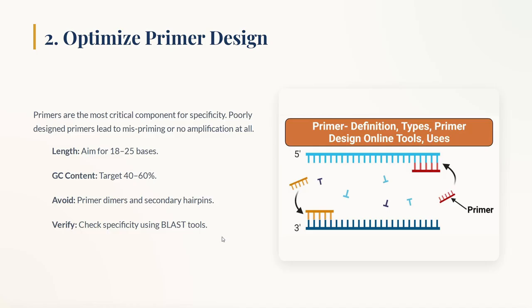So when you are designing using several tools like Blast, I have also mentioned many other tools in my videos. So I'll give you a link at the end of this video, so you can check all those tools. Like there is one MFE, then there is UCSC In Silico browser, Blast is there, right? So we have several tools available nowadays.